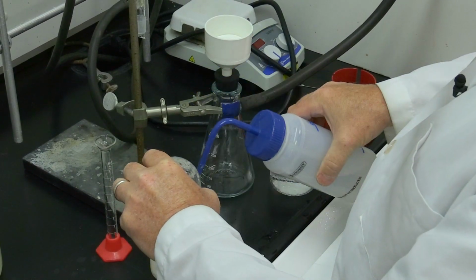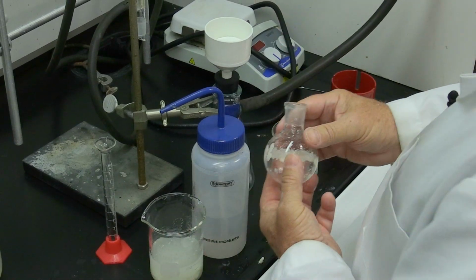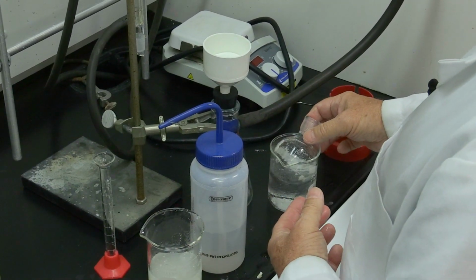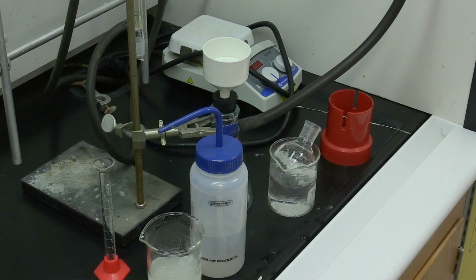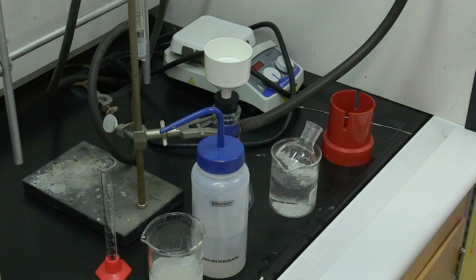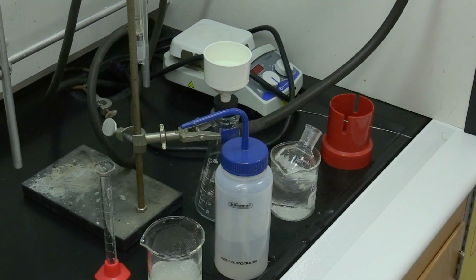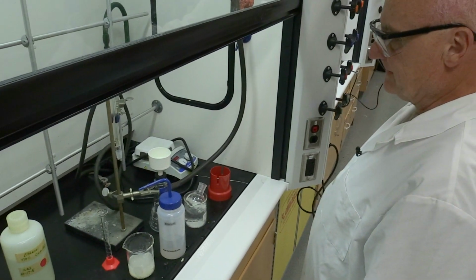Okay. Now we want to turn on, we may have to try to get some more of that out. Turn on our vacuum. We've already weighed the filter paper.